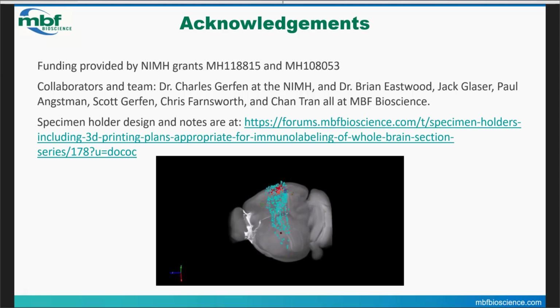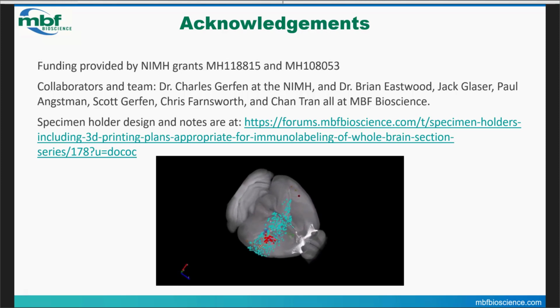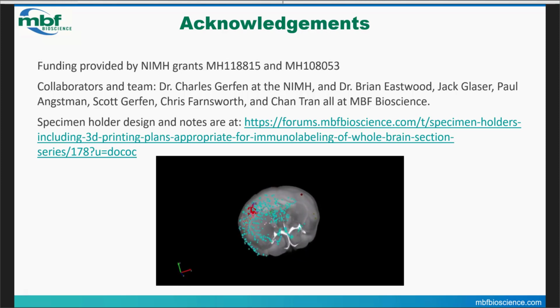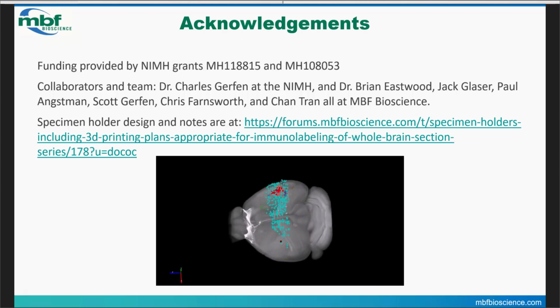But this third line gets to something that someone asked about, and this link will take you to the forums where we've posted notes on the materials for 3D printing these chambers, as well as the files that you could put into most 3D printer programs. So I wanted to address that.